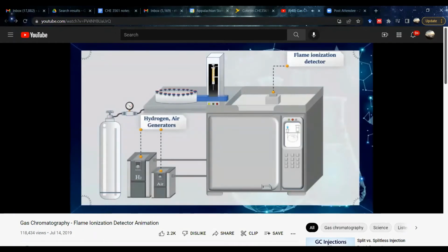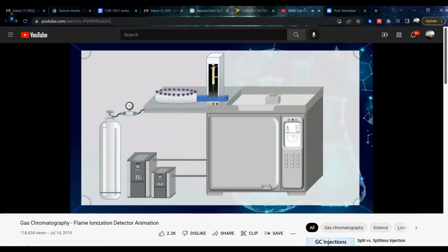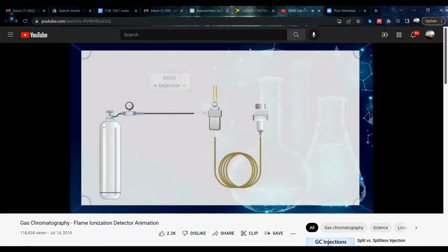The flame ionization detector is almost universally employed, where the flame commonly is generated with hydrogen and air. The auto-sampler provides the means to introduce a sample automatically into the inlets. Also, manual insertion of the sample is possible. The column inlet, or injector, is attached to the column head and provides the means to introduce a sample into a continuous flow of carrier gas.